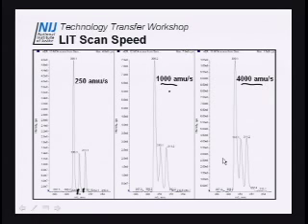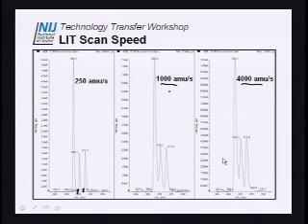If you're using GC, you think of masses as lines on a graph. What is that called? Centroid, that's right. We think of things as being centroided, which just replaces this peak with a line. But this is how the instrument produces mass spectral data. And you can see the difference between 250 and 1,000 and 4,000 by the increasing resolution of masses as I decrease the scan speed. Remember, it's an ion trap. Resolution is controlled by the speed, and that's it. Any questions about that?